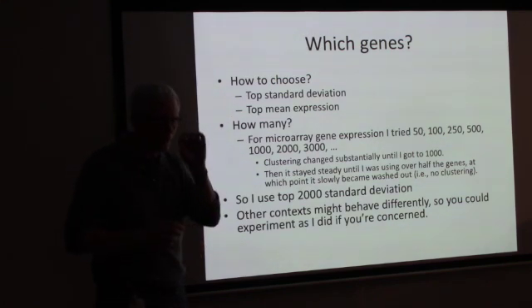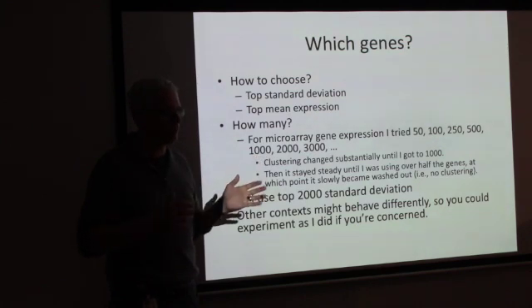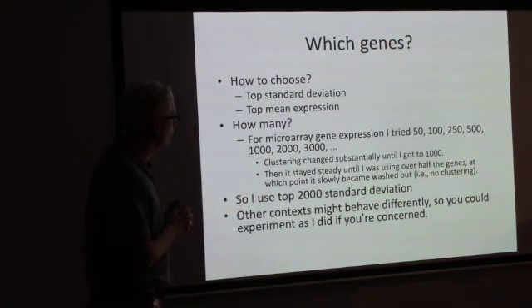And why do you not want things that are very lowly expressed? Because if they're very lowly expressed, you're probably just getting noise, and they're not going to help you understand your data.